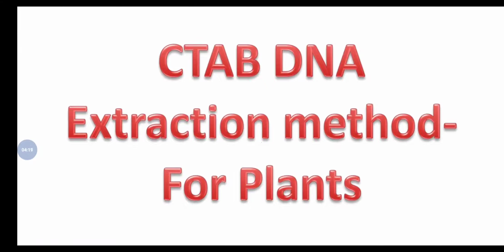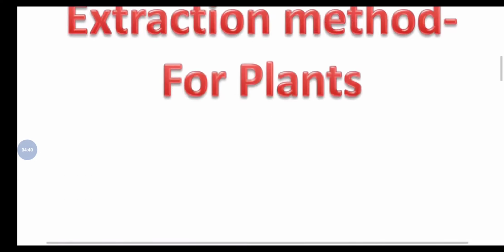So let's get started with the DNA extraction method for plants. We will read this topic in a stepwise manner, in a kind of flow chart, and we will discuss the function of each and every chemical we are using and the different steps we are including in this method. So let's begin with this topic.